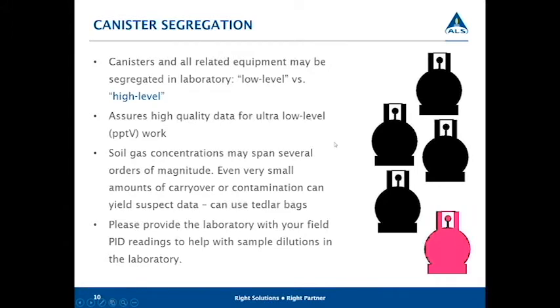Canister segregation. All canisters and all related equipment are segregated in the laboratory, low level versus high level.